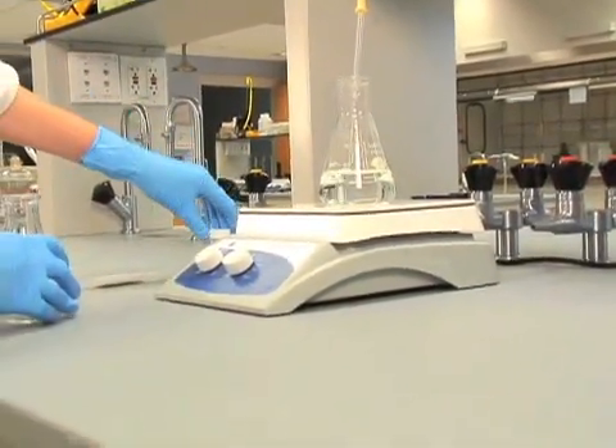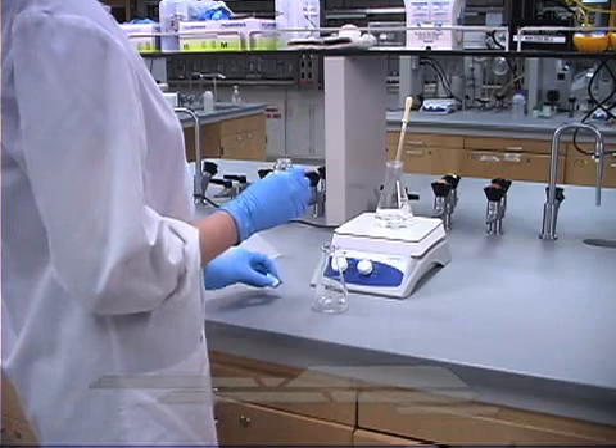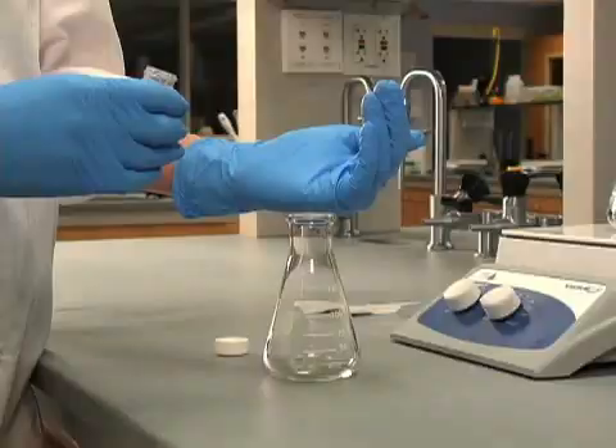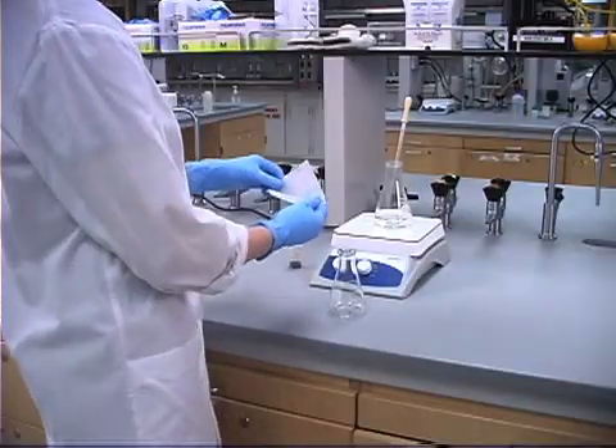For this experiment, we're using water as our solvent, which I've already preheated. Now, let's add boiling chips, followed by the impure compound.